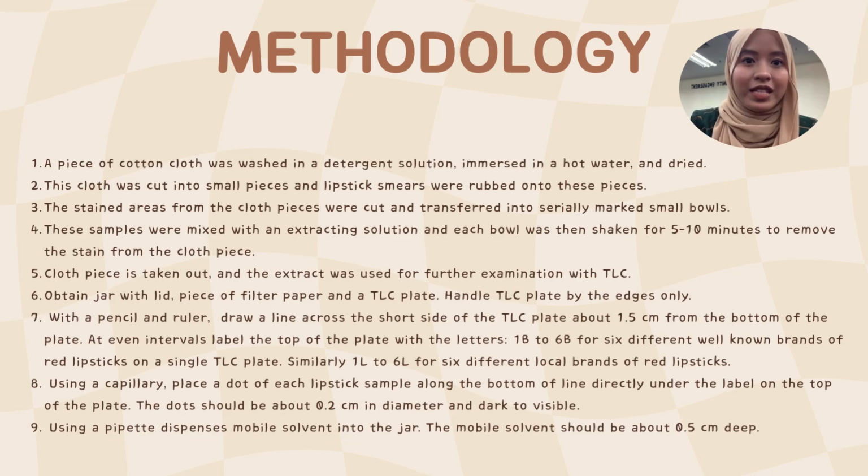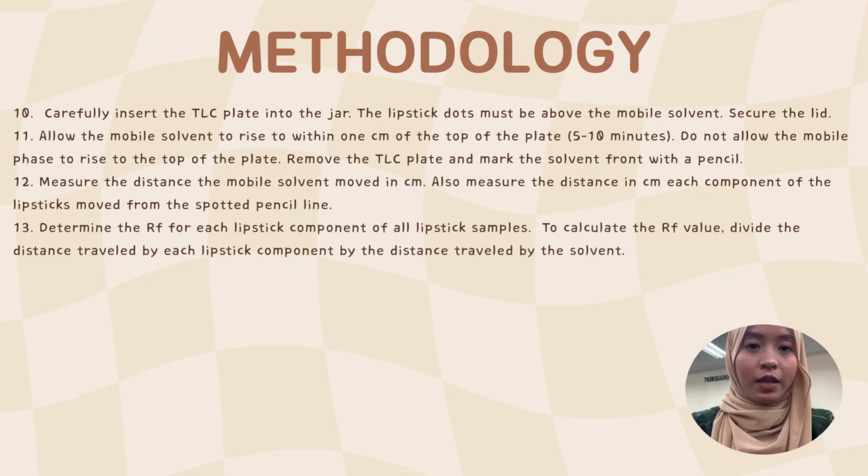Number 9. Using a pipette, dispense mobile solvent into the jar. The mobile solvent should be about 0.5 cm deep. Number 10. Carefully insert the TLC plate into the jar. The lipstick dots must be above the mobile solvent. Secure the lid.